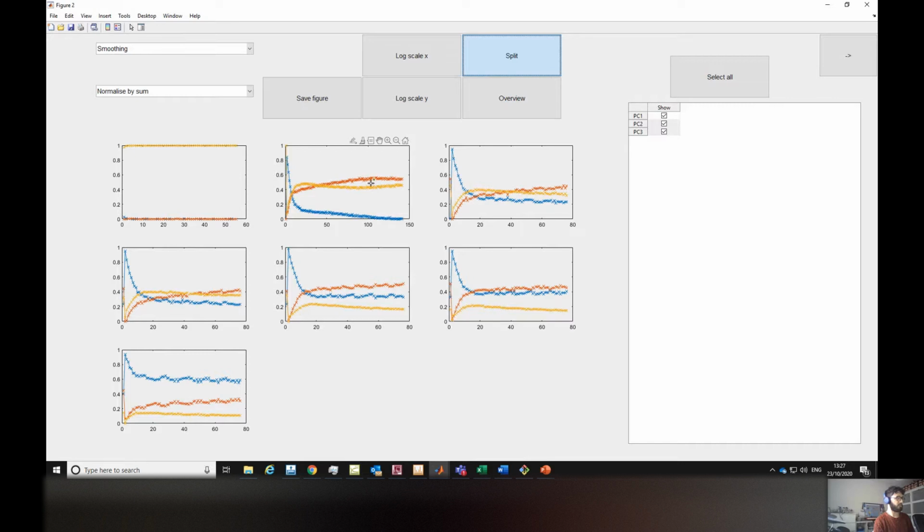And also you can do some more post-processing. You can just do extra normalization and work out the relative amount of gold on the surface from each of those, but not only using the gold minus peak, but using the signal that was picked up from the analysis that takes into account all the gold peaks. So yeah, to me, that's very useful. So I hope you can see how you could use this on some of your data sets as well.